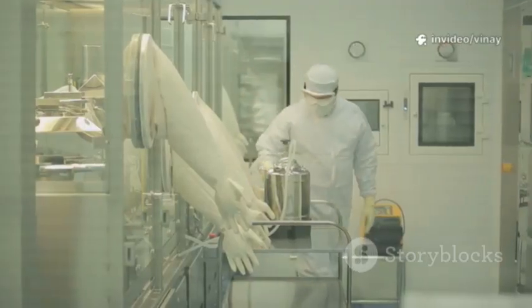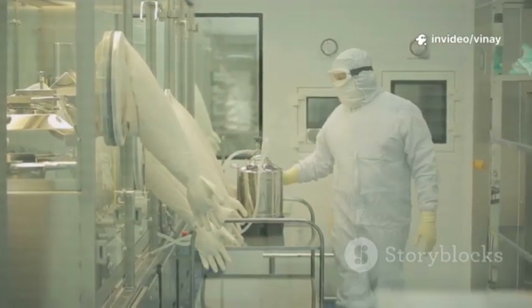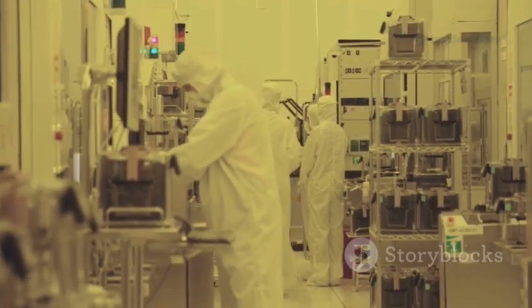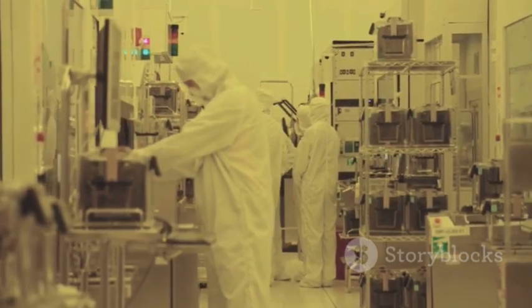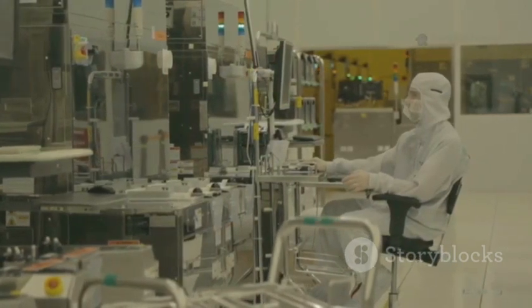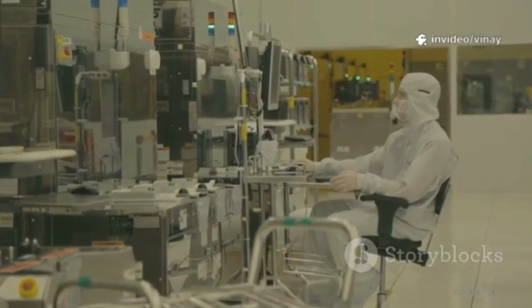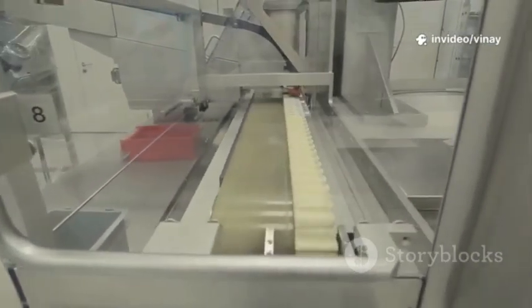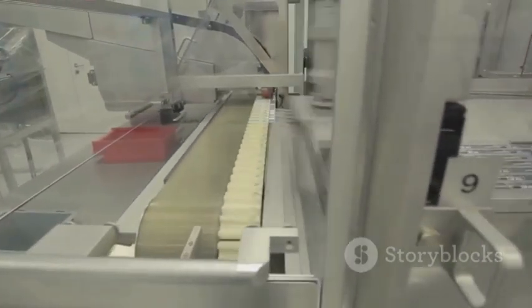Operators are trained to never position their bodies or any non-sterile items between the HEPA-filtered air source and the exposed sterile product or components. They must maintain an awareness of the first air, the clean air coming directly from the HEPA filter, and ensure it is never obstructed from bathing the critical sites in a protective curtain of sterile air.